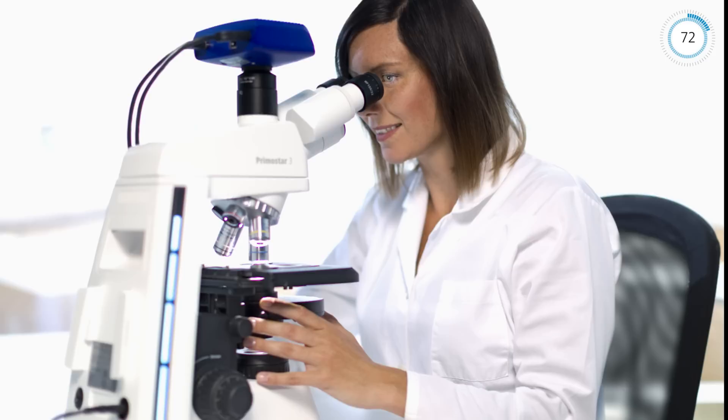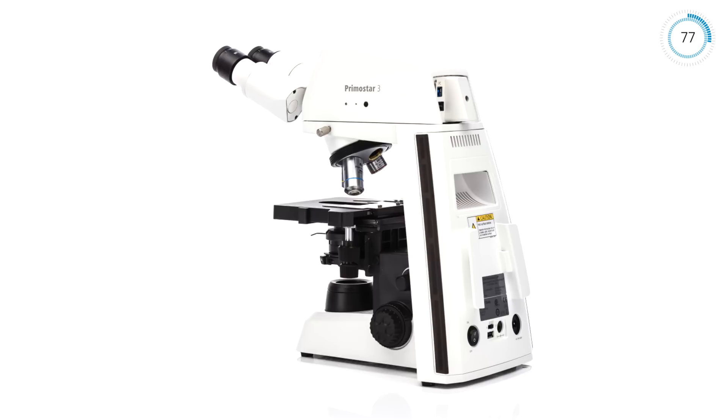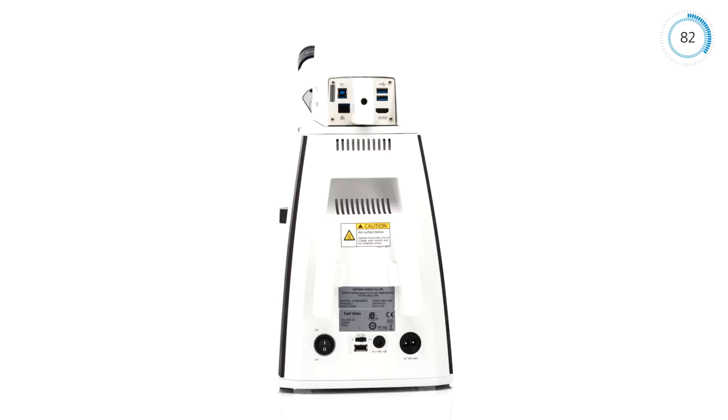PrimoStar 3 is made of solid materials, so you can rely on a mechanically stable and resilient microscope. That built-in durability is reflected in our offering you the benefit of an extended warranty of up to 5 years.